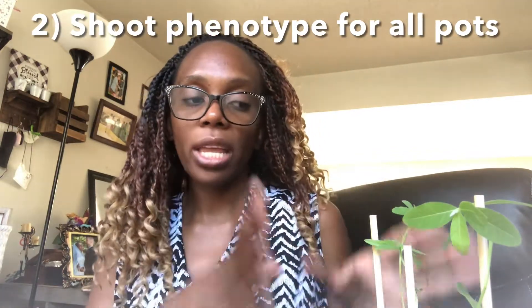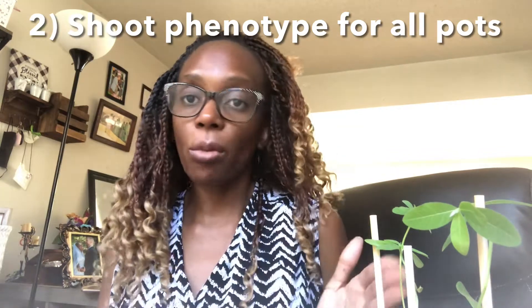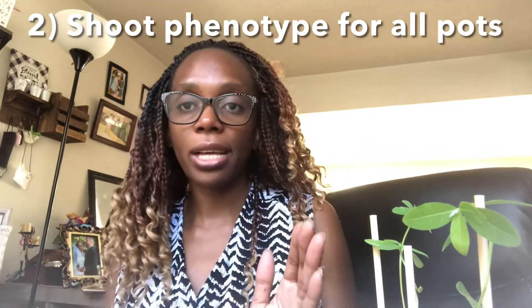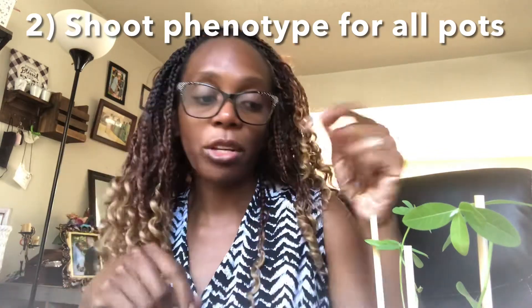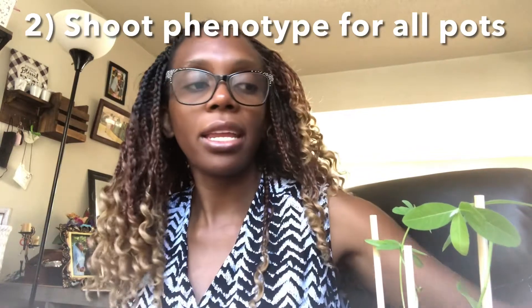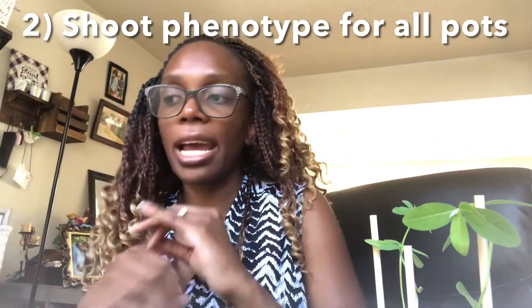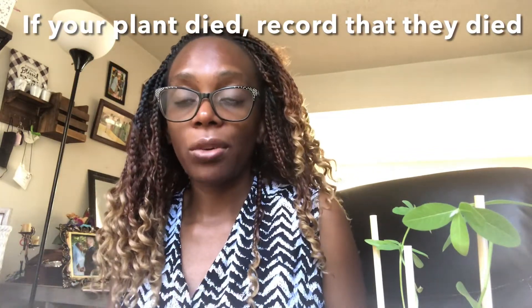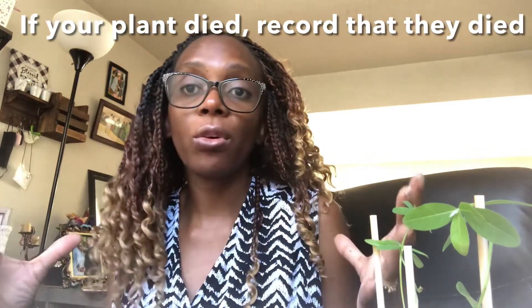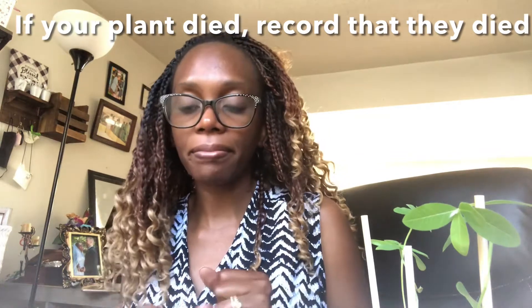Second, we do our second shoot phenotype. Like last week, get one plant from each pot. If you have only one plant that grew, go back and phenotype the same one. If you have more than one, phenotype a different one. Dig it out, put it on a black surface, rinse off the soil particles using a container with water. If unfortunately all your plants in one pot died, that's okay — record it and you'll only have two phenotypes that week.